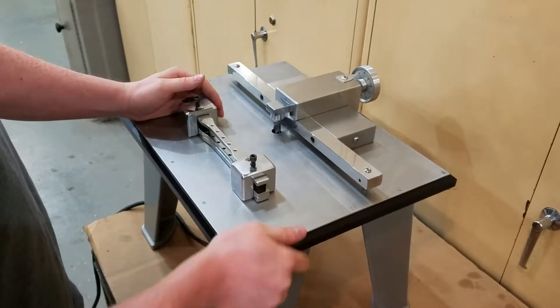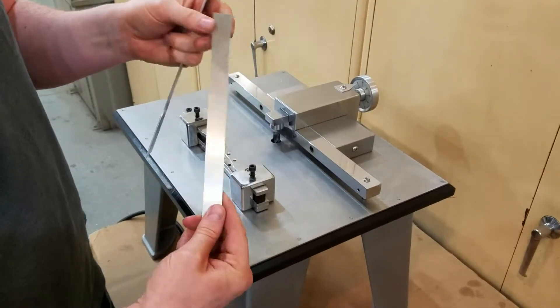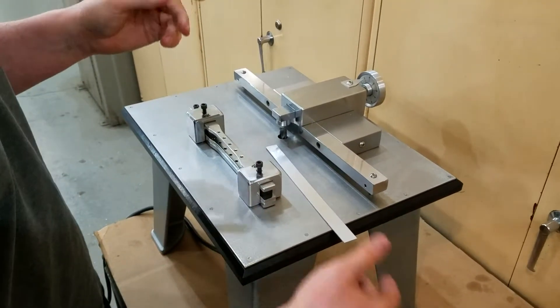Today we're going to do a quick video on our Tensor Cop 1. The point of this machine is to take strips of your material — in this case today we're going to be doing a piece of aluminum — and it makes samples out of them for ASTM testing, or whatever testing.